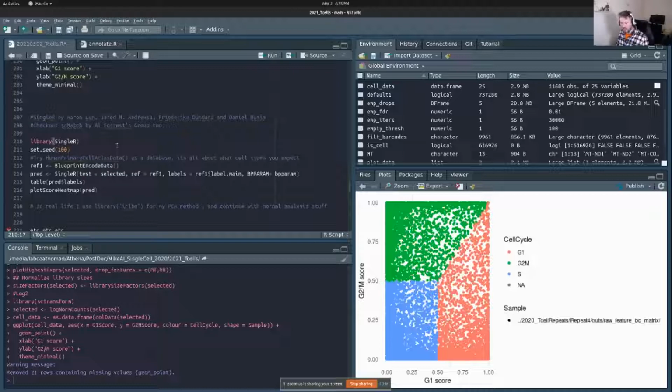Next thing I always do is make sure the cells are the ones I'm looking at. I use SingleR right now because it's Aaron Lun's package. Disclaimer, I'm co-writing a book with him on multimodal analysis for CITE-seq and BCR-seq. So I'm trying to use more and more Bioconductor packages because the book is supposed to be able to complete the entire thing with Bioconductor. But there are other packages out there. I used to work in Perth, Australia with Alex Forrest's group. We actually developed scMatch. Check it out. It's a great alternative. It's exactly the same thing, Python based instead of R based, but otherwise the same.